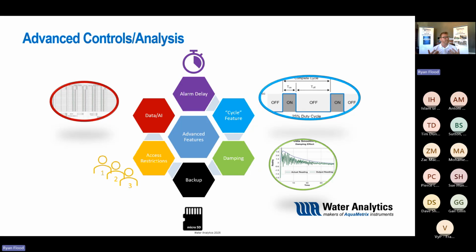You want to see a nice stable number, right? Maybe your facility likes to see things nice and clean. So instead of something jumping from a pH of 7.21 to 7.23 to 7.25, maybe you want it to be nice and steady and average that out. Dampening can help you with some of that averaging, simplifying your view. But it can also help in terms of the alarms. If you're able to dampen out, you want to know that it's a trend, not just the one static number.